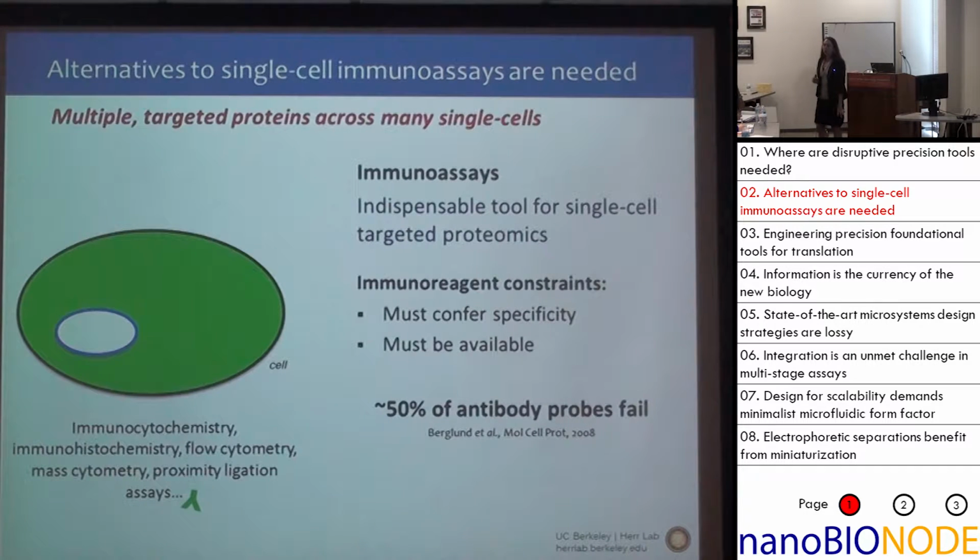And I don't know if any of you run a lab here, but certainly if you were a PI, you're hard at work raising funds for your research group. These antibodies are actually quite expensive, and then to know that about half of them fail, which means your assays are going to be essentially garbage, is just a horrible position to be in, right? Let alone the person who's trying to actually implement the assay and interpret the data, right? It's kind of a very big issue.